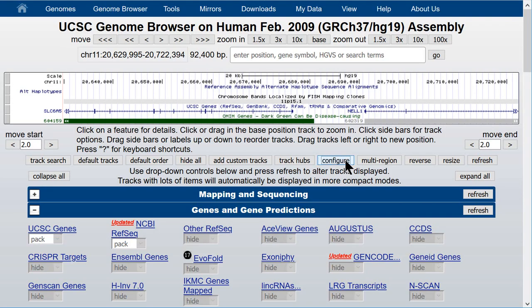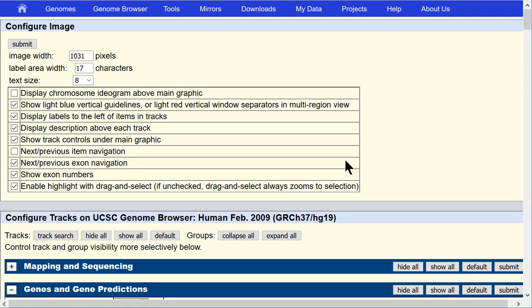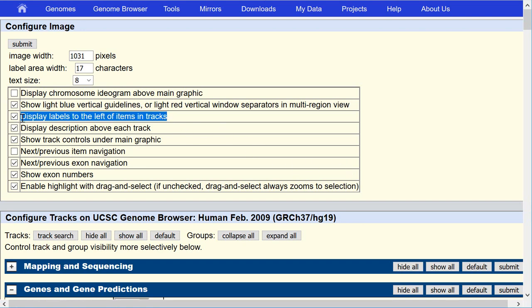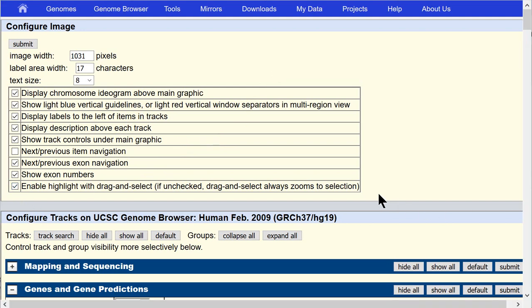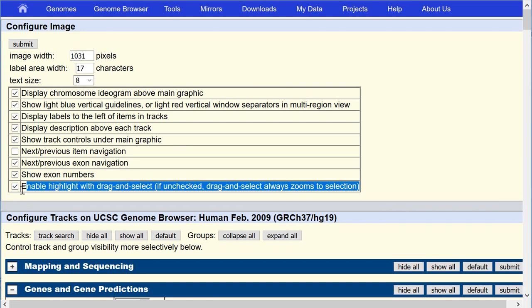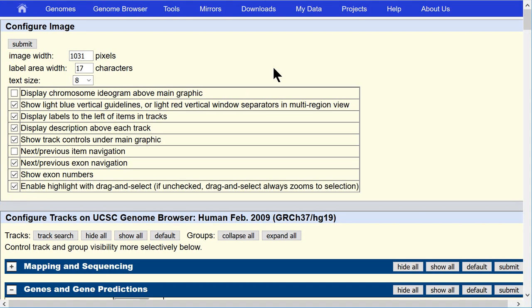Let's configure one more time. The other options are fairly obvious — display the labels, display the description. There is one option that can be a bit surprising: if you uncheck the 'enable highlight with drag and select' option, then the dialog box that appeared when you dragged the mouse over an exon will disappear, and you automatically zoom instead. This is fine unless you forget you did it, and then it becomes problematic — you have to remember to come back to the configuration page and turn it back on.